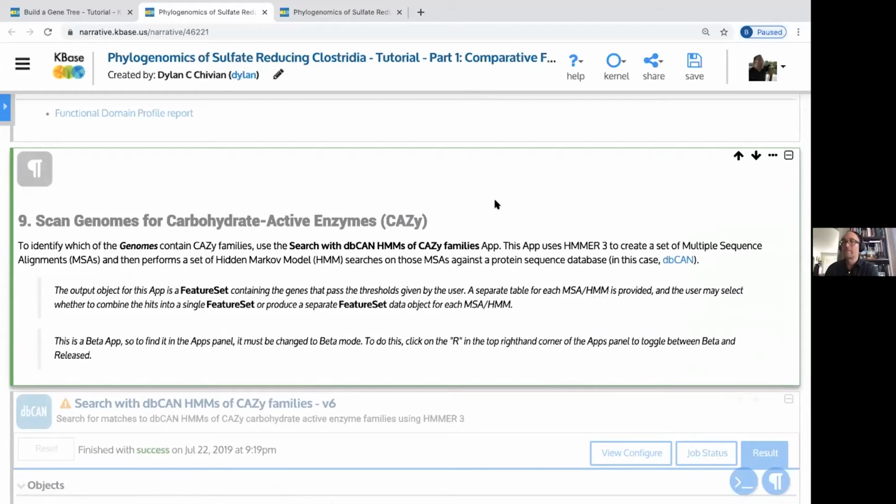So that's sort of general whole genome, whole namespace annotation. But we may want to do something more targeted. We may be interested in a particular functional classification or trophic assignment, and don't want to spend all the time using all of COG or all of PFAM. And we may just have a custom collection that we want to use.